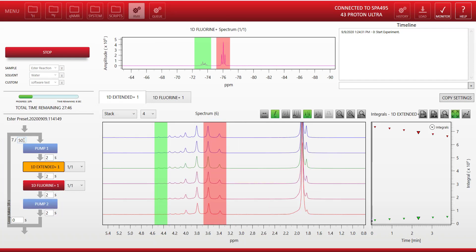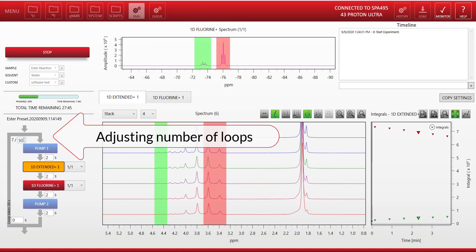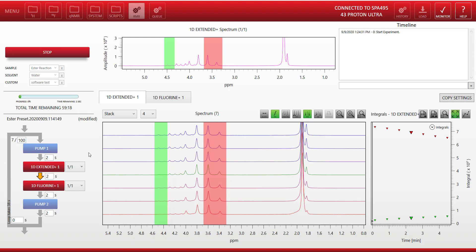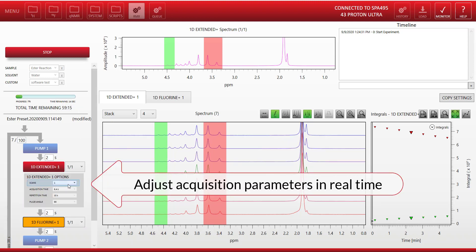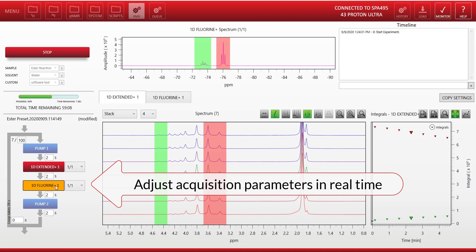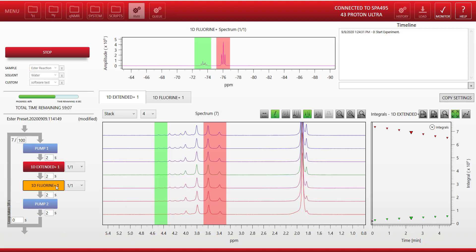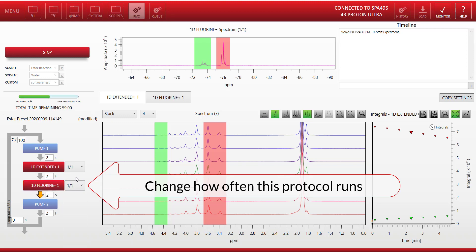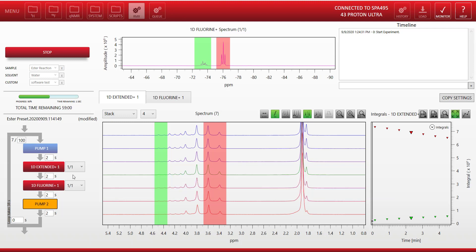As the protocol is running we might want to change some parameters. So here we're adjusting the number of loops from 50 up to 100. We can also adjust the acquisition parameters of the protocol, so we could for instance change the number of scans we wanted on a particular protocol if we needed more signal averaging. We could also change the delays between the different protocols, and here we can adjust how often a particular protocol is run—every second loop, every third loop—if we found we were acquiring too much data.